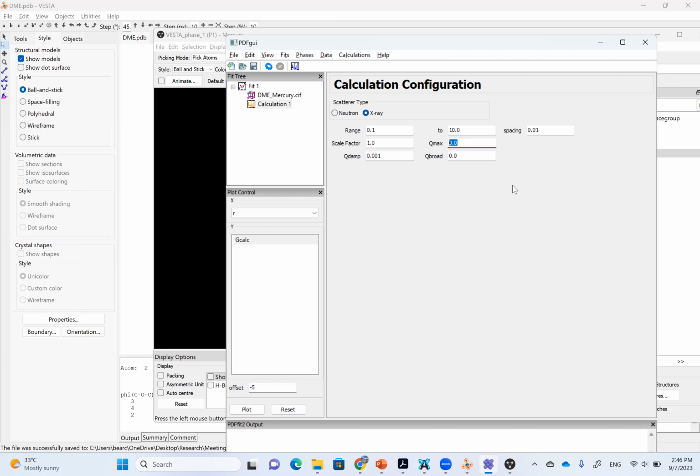So I'm throwing another quiz. What's the typical Qmax we can get at XPD? 26. Okay, one prediction is 26. Any other ideas? I think we can get up to 50, but we usually cut that off. 50. Okay, Dean is very optimistic. So 40 to 50, right?